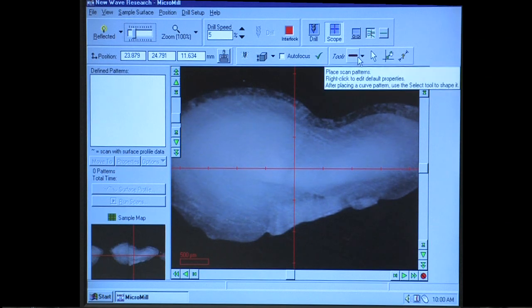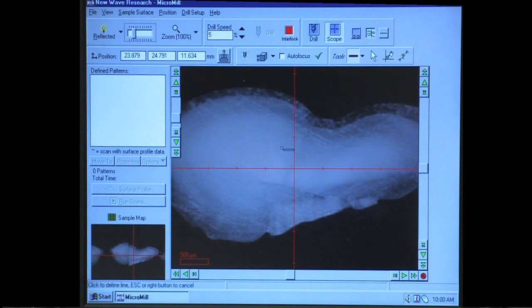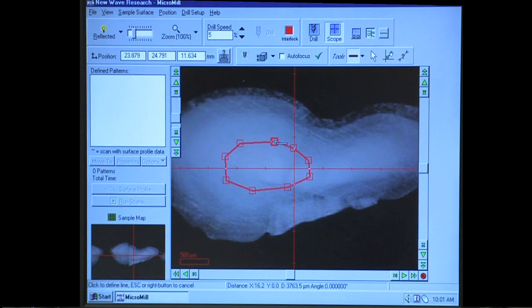To sample a core or an annulus, choose the Line tool or other suitable tool from the Tools button at the top of the screen. With the Line tool, you can draw out the area of the otolith core you want to extract, tracing the particular annulus or area of the sample you want. The line will show up in a defined line pattern window on the left of the screen. Click the left mouse button to start the line and each time to add a new point. Click the right mouse button to complete the pattern.